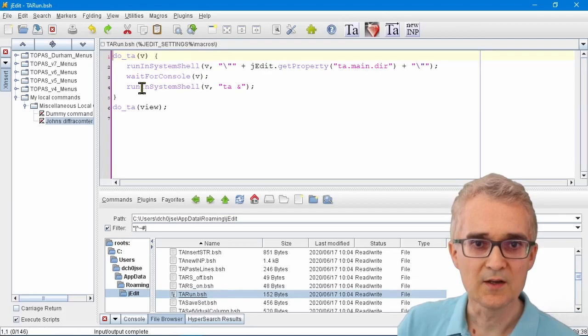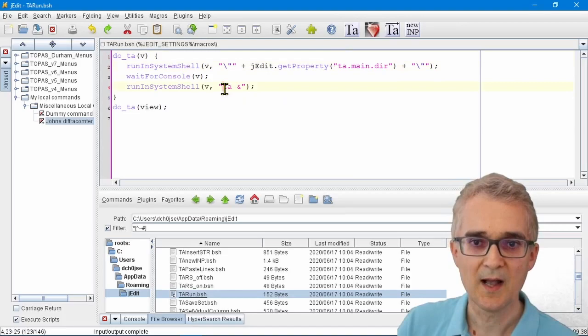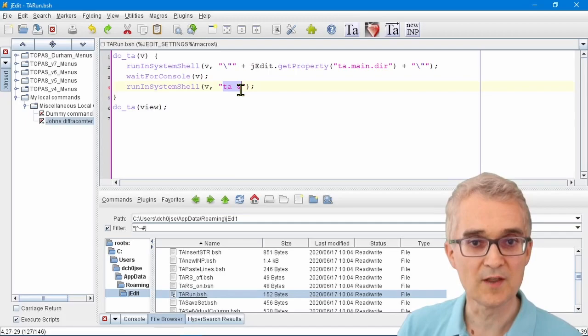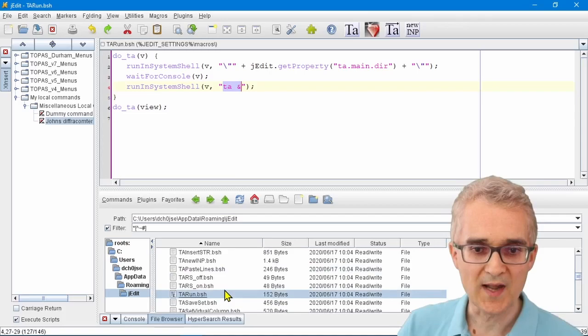You can change these things to install other pieces of software or run different pieces of software. For example, some people use a different routine for reading a CIF file into Topaz.